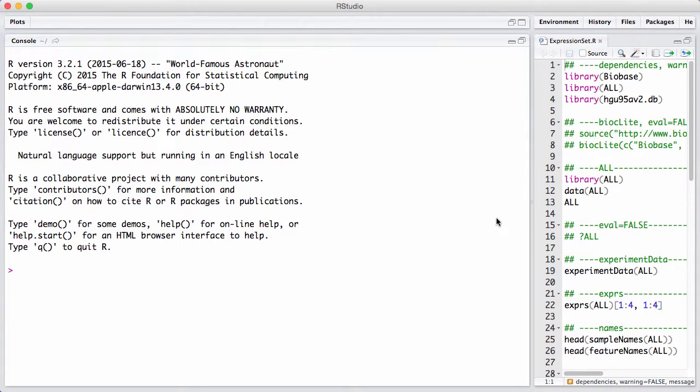In this session, we will showcase the expression set data class. This is a very important data container in Bioconductor. It is important in its own right, and it's also important as a foundation for a lot of other data containers.